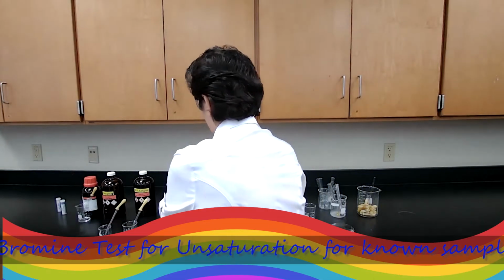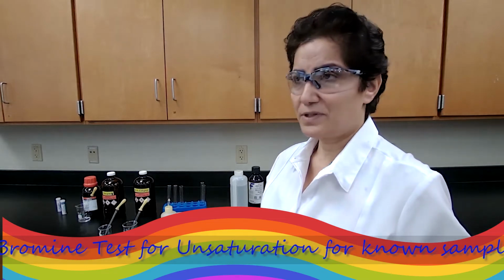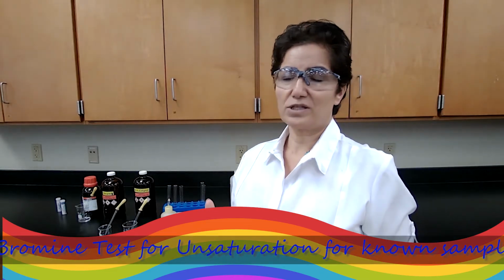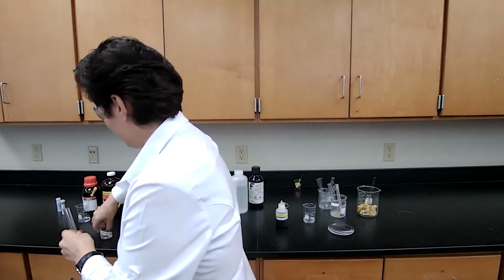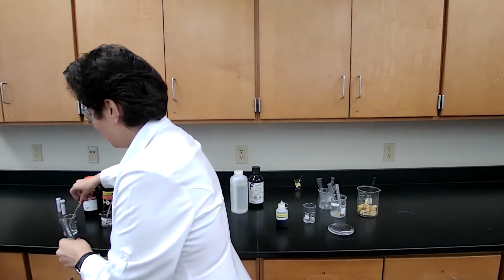Now, we are going to continue with the next step, which is the bromine test. What does the bromine test do? In the bromine test, if the color of the bromine disappears, we know that the compound was unsaturated, like an unsaturated hydrocarbon. Basically, it has a carbon-carbon double bond. If the first drop of bromine that you add to the hydrocarbon or your sample does not disappear, that means there is no carbon-carbon double bond. So the positive test for the bromine test is if the color disappears.